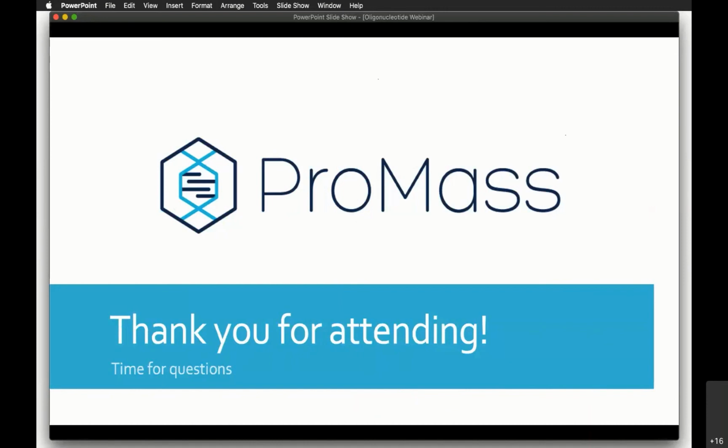So we would basically need to do it. I'm assuming you're one of our oligo customers, you're not running ProMass on your end, right? Correct. So we would need to input the sequence on our end into Excalibur and reprocess the data. But if you're sending in samples, you're welcome to include the sequence. You can send a sequence instead of a mass or in addition to a mass. It's usually good to send both just in case. We've had probably countless times where people will send a miscalculated mass based on the sequence. Gotcha. Perfect. Thank you.